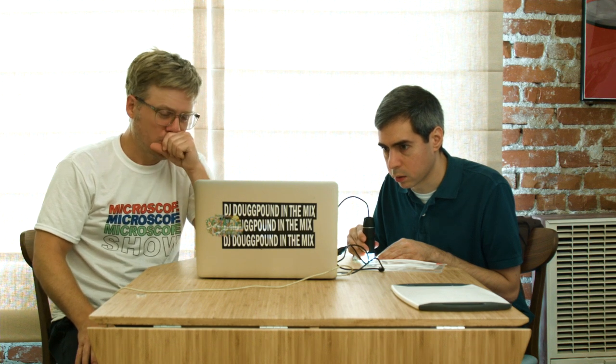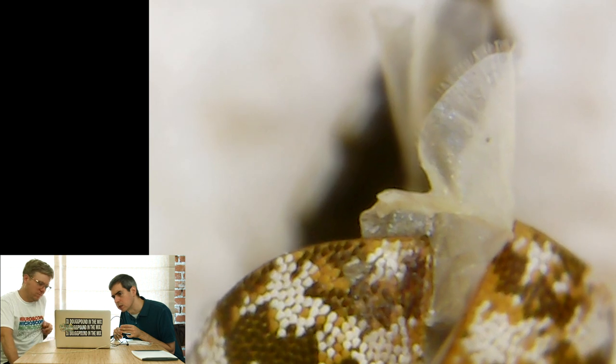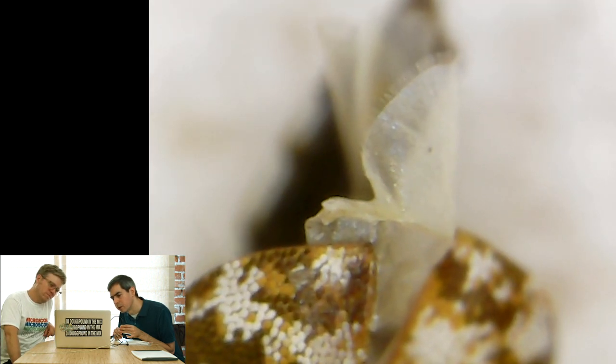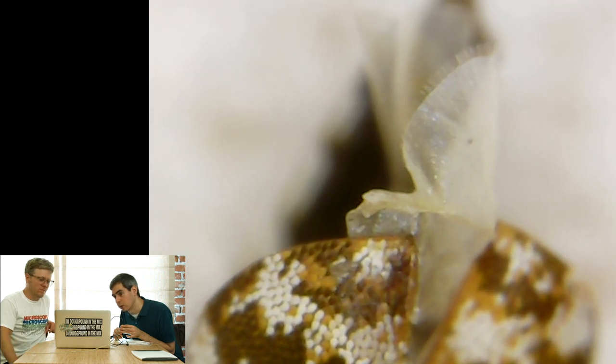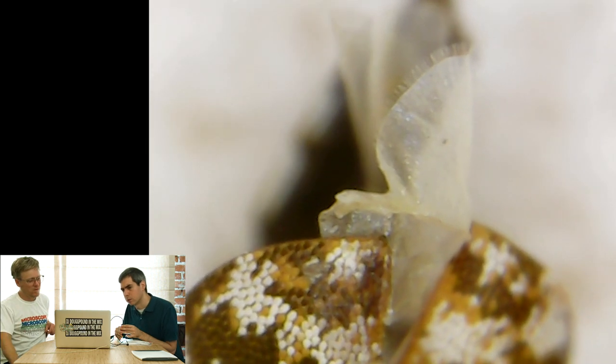It's got kind of a 70s brown interior design look to it. I want to just see back inside the body with the thousand magnification. Now, where is the dang thing? Look at the wing. Wow. Look at the wings. You can see little things on the edges of the wing there. When you see something flying around in your house, just a tiny little thing, these are what it could be.